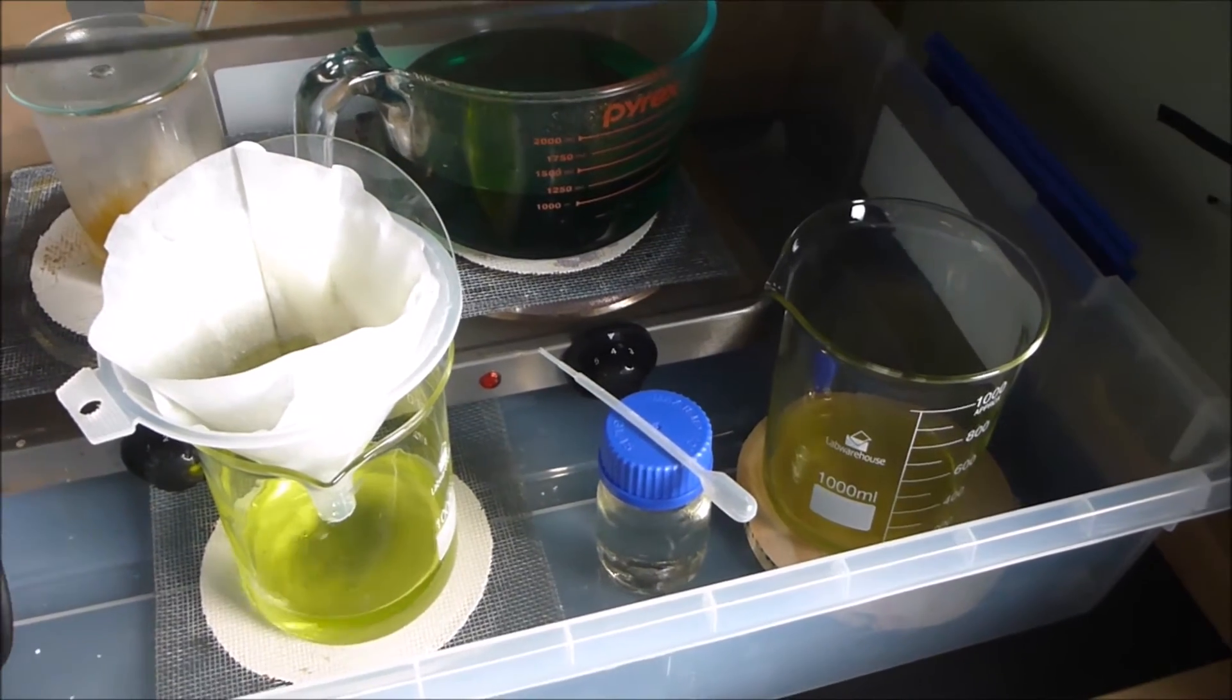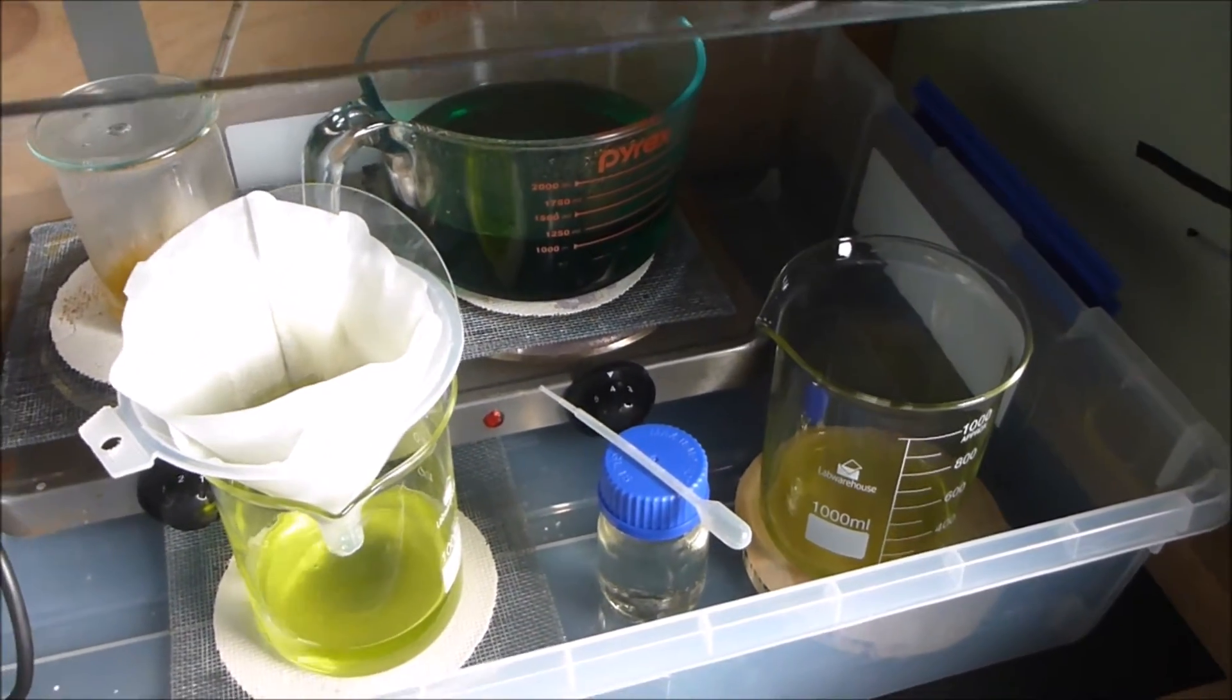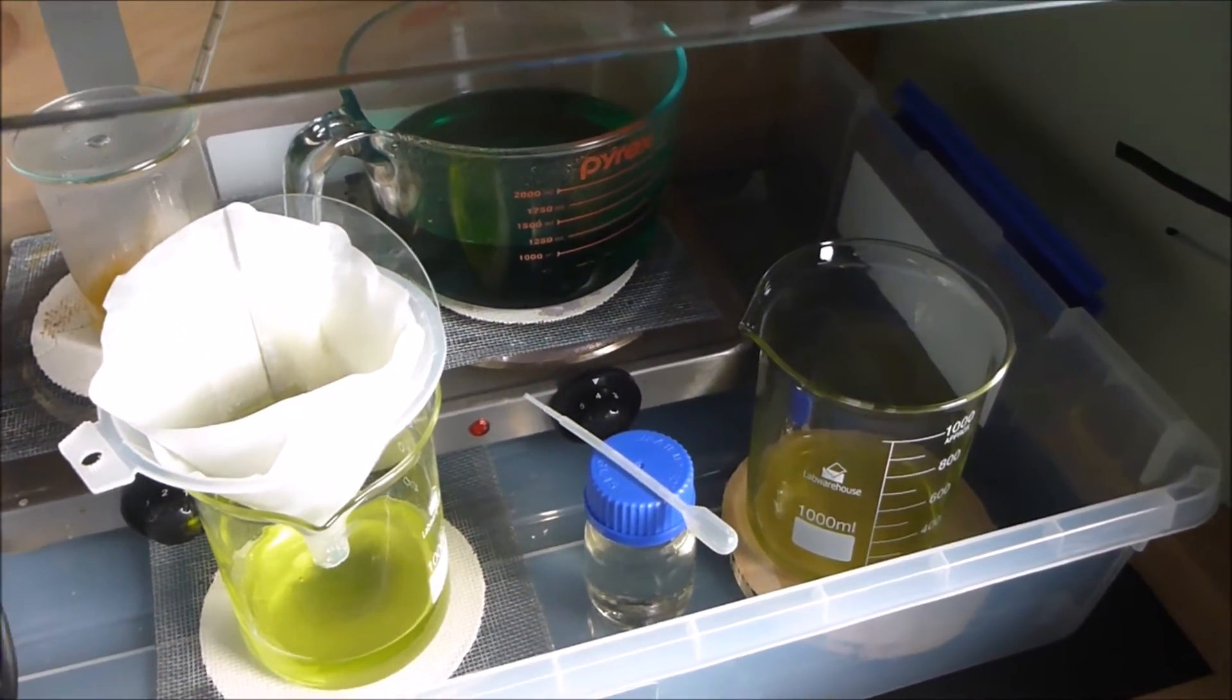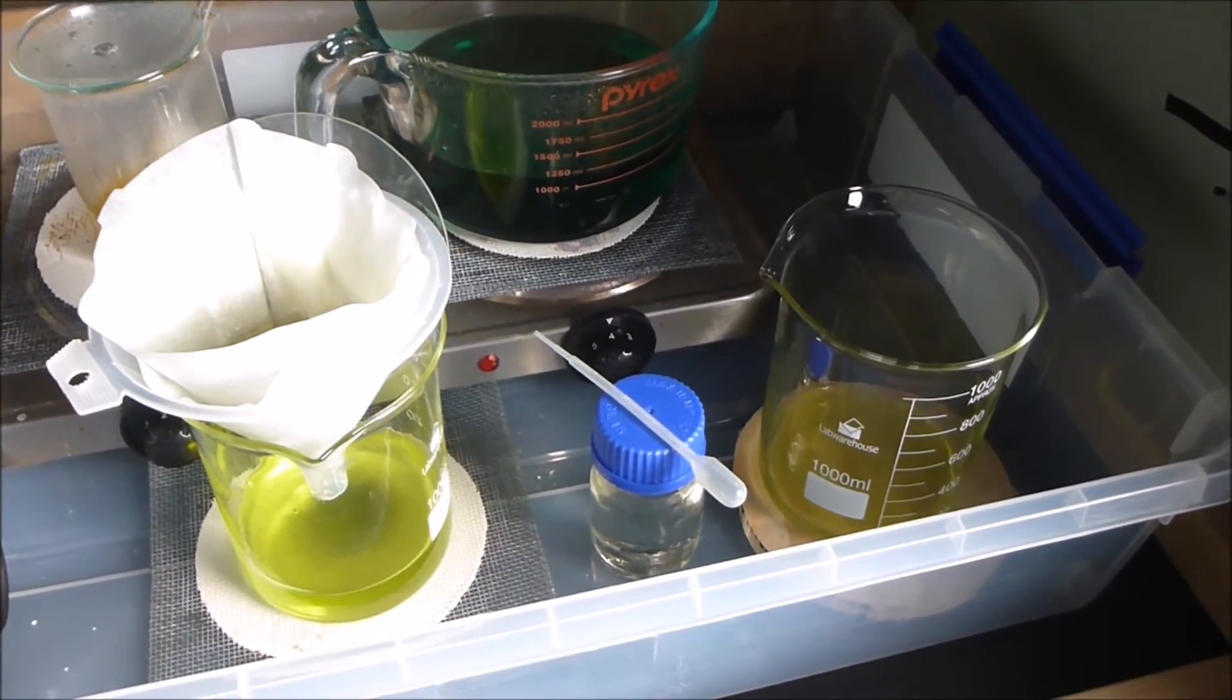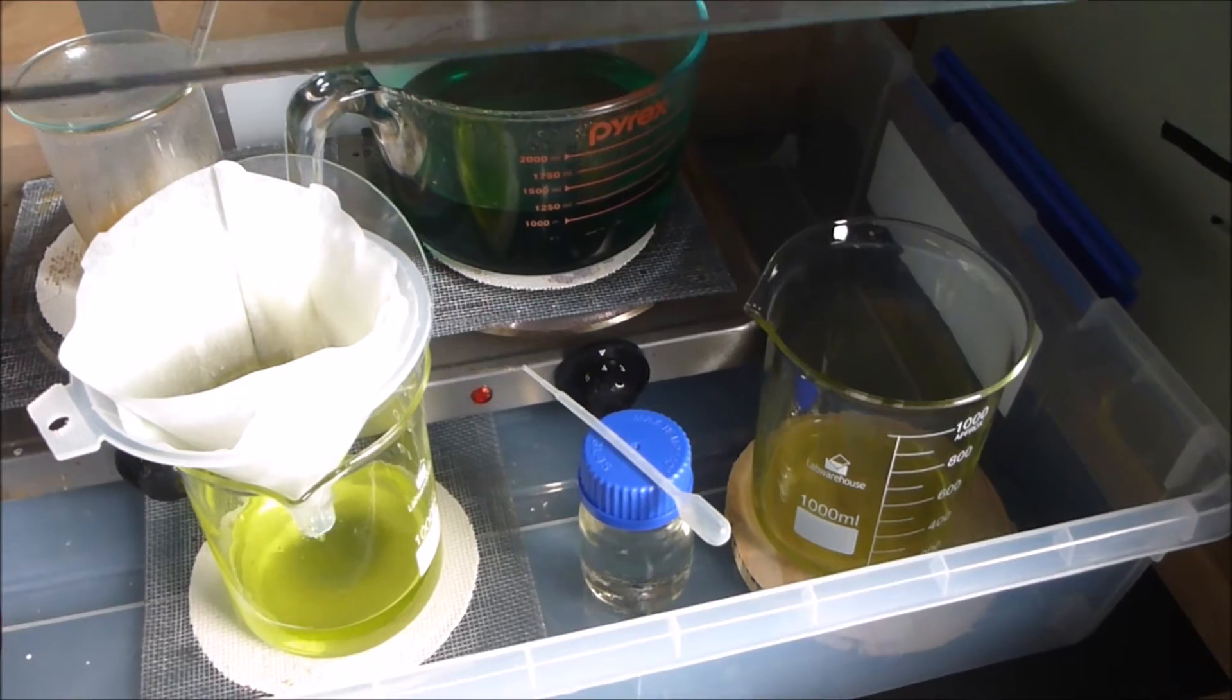Before you precipitate the gold, there has to be a lot of water in the solution for the sodium metabisulfite to work properly - to react with the hydrochloric acid and give you the sulfur dioxide you want.